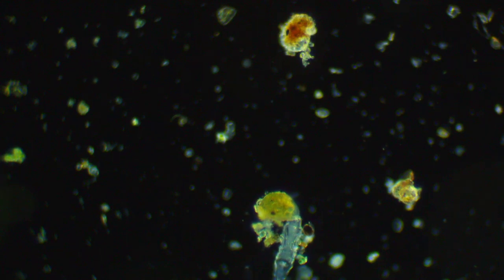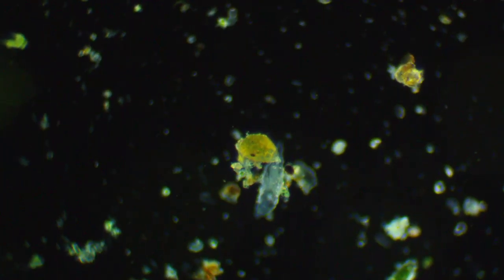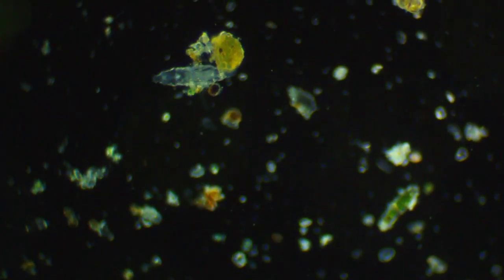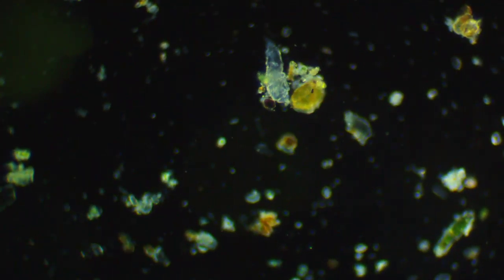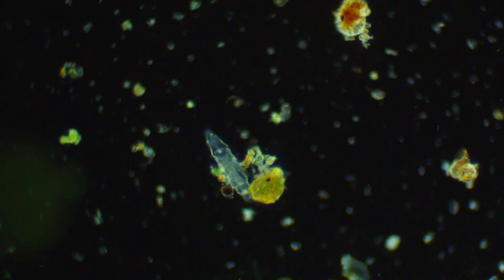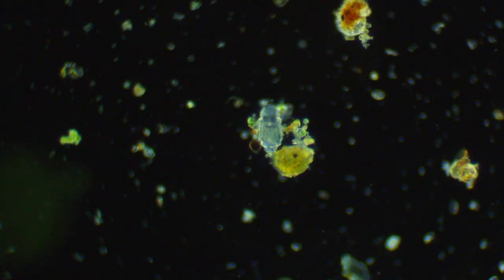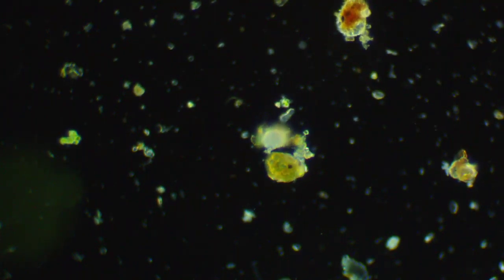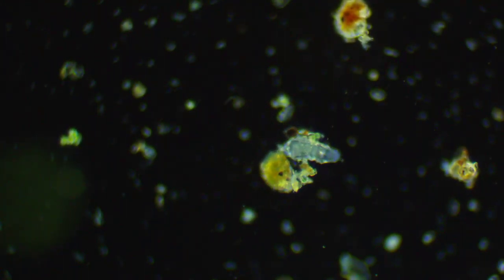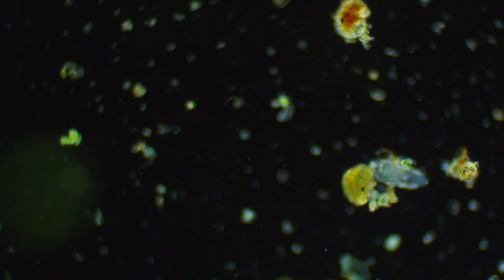He's a little bit slower than some of the other rotifers I've seen. And I think this is a different species because of the head shape. And now I'm looking at the body shape. He's got these wrinkles that go along his body. It's pretty cool. Moves around like an inchworm, and then when he's ready to try to eat some little particles of food in the water, he'll open up his little wheels and start spinning them around. Move the water around. Yeah, it's portable moss.